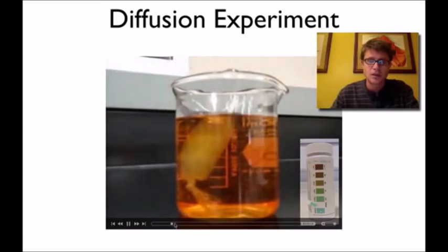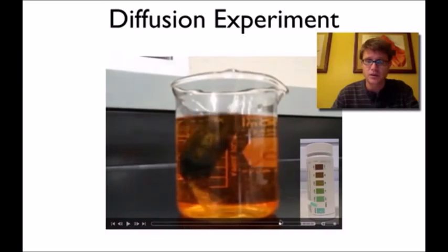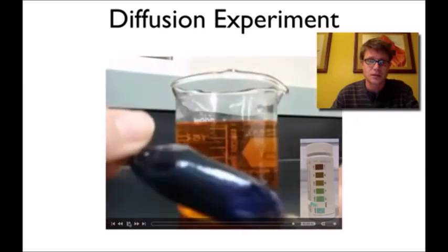You can see immediately that it starts to get a coloration change inside the beaker. Let me move it up a little bit faster, so it'll look all the way out here. Right. Let me play it there. So this is like 10 minutes later.